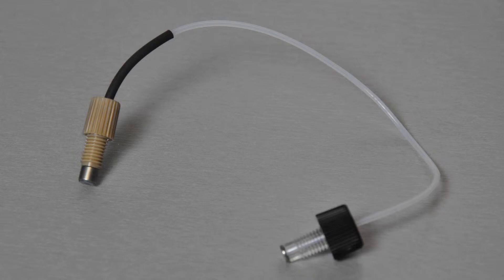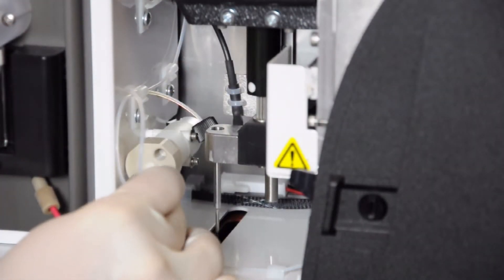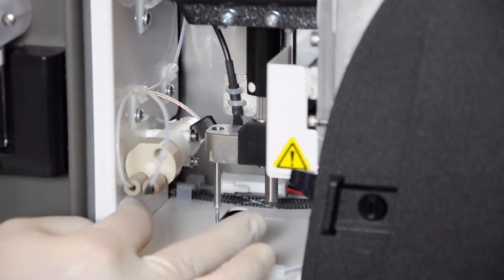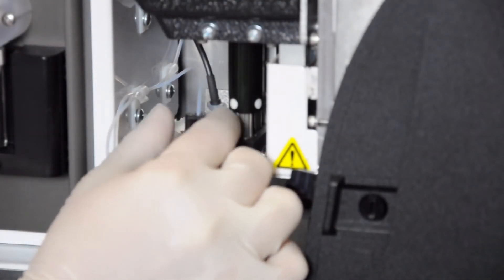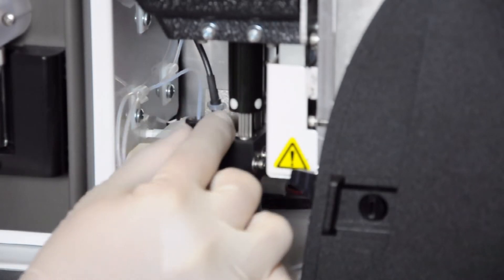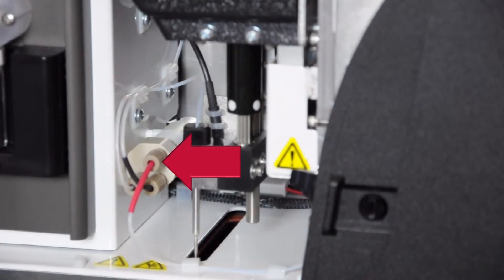To replace the sample probe tube, thread the new piece of tube through the strain relief. Screw the flat bottom fitting on the end of the new sample probe tube into the valve and tighten the fitting until it audibly clicks. Screw the probe fitting into the top of the probe assembly and tighten the fitting until it audibly clicks. Ensure the red valve fitting is also reconnected.